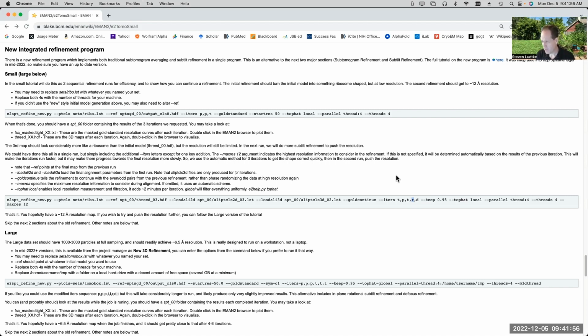Now, in pretty much all cases, this does very little that's useful, and it takes a really long time to run because of the slowness of doing the corresponding rotations. T is quite fast. R is pretty slow, and I've rarely seen it make a measurable improvement in the structures. It's available, and it's worth a try if you're really trying to push things.